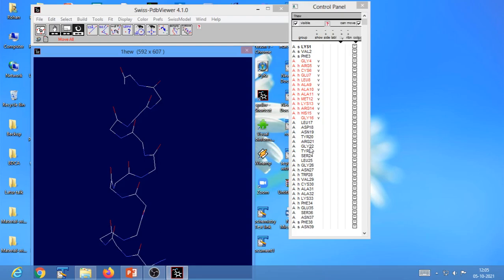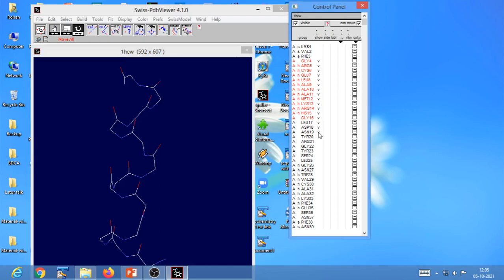I will show you. We would click in the show column next to leucine 17. We would click over here and drag down to 22. Do you note what I have done?